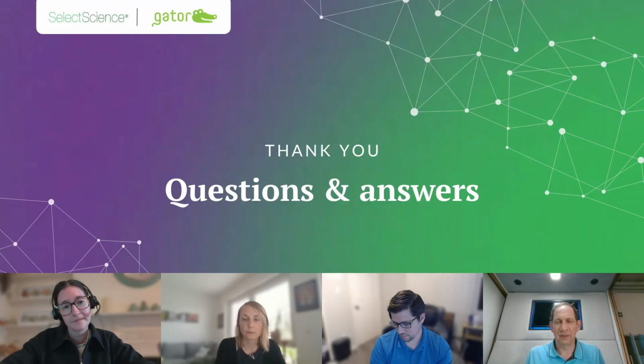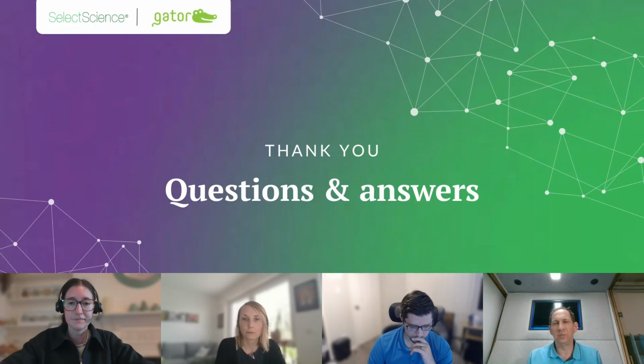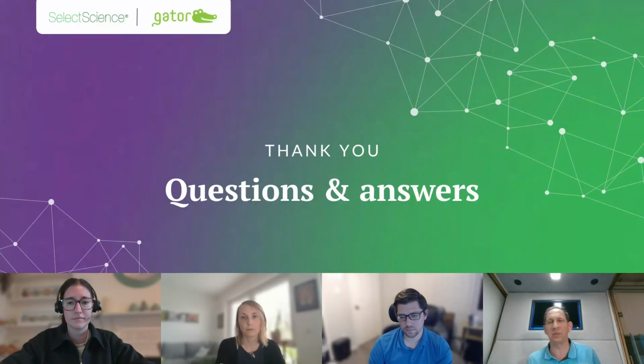So, when people are working in the lab, even people who are very good at what they do, sometimes they make mistakes. They pipette into, let's say, the wrong well. They thought that we needed target 1, but we actually needed target 2.